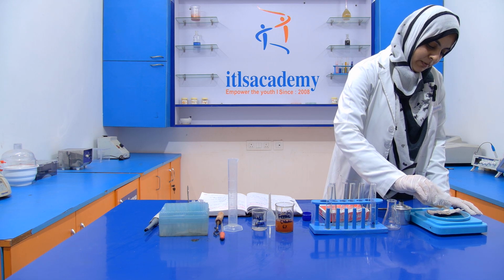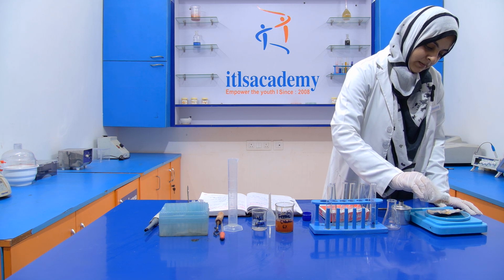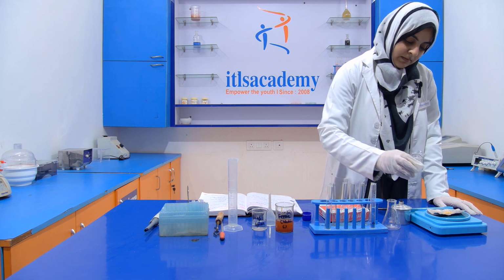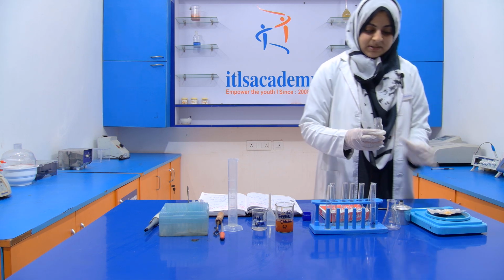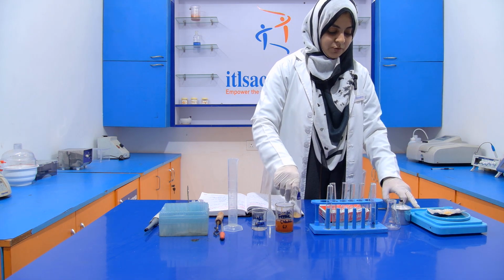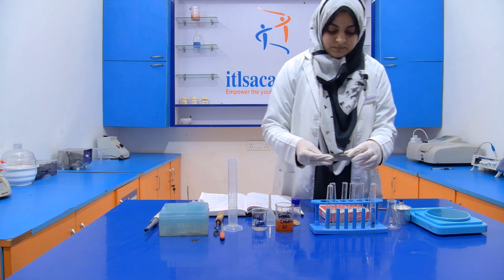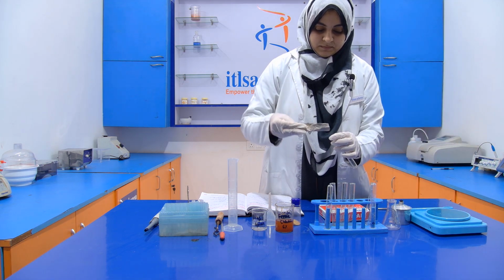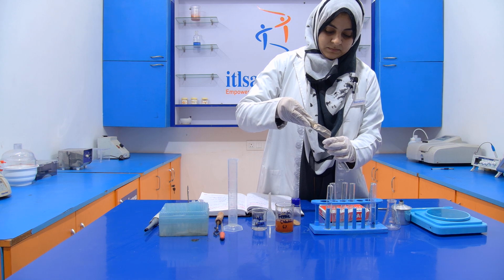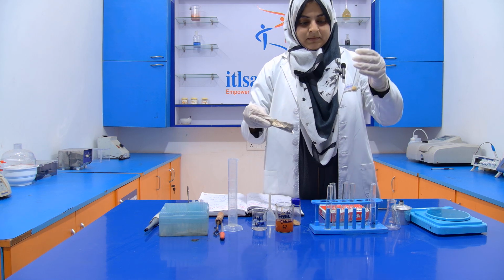Add a little amount. Now this is around 1 gram. Now transfer this 1 gram of Asafoetida into the test tube. Transfer it very carefully.